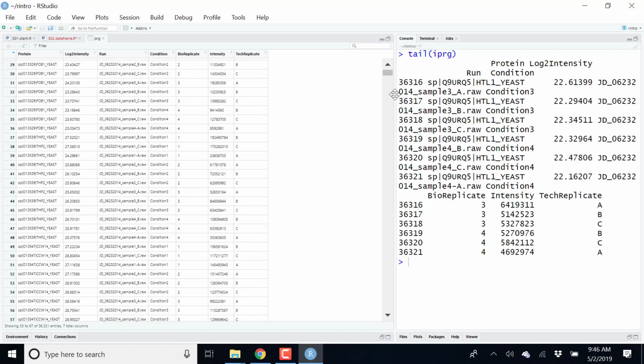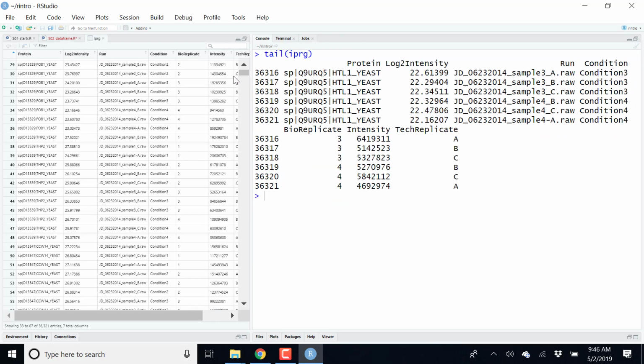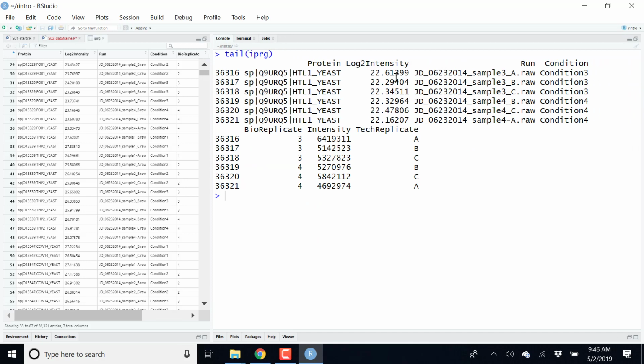So what about the other people? Do you see decimal numbers? So here, look, 2 intensities, yes, but not in my intensities. So you have decimal numbers in your intensities? Yeah. You too? Okay, so there might be differences in the RStudio versions. They might display the decimals. Let's see. No, I'm not going to do that now because I will use syntax that we're about to see.